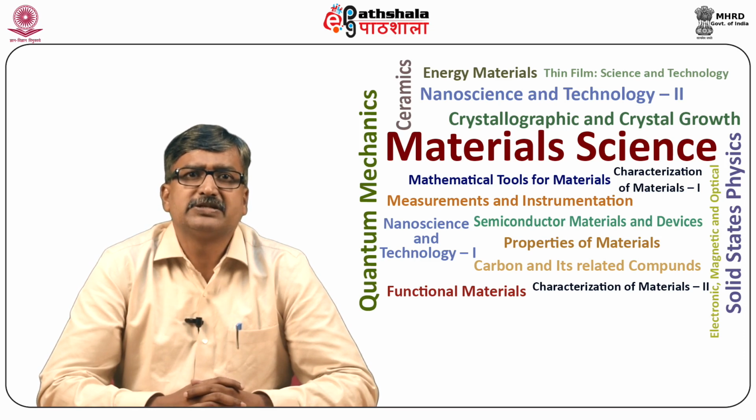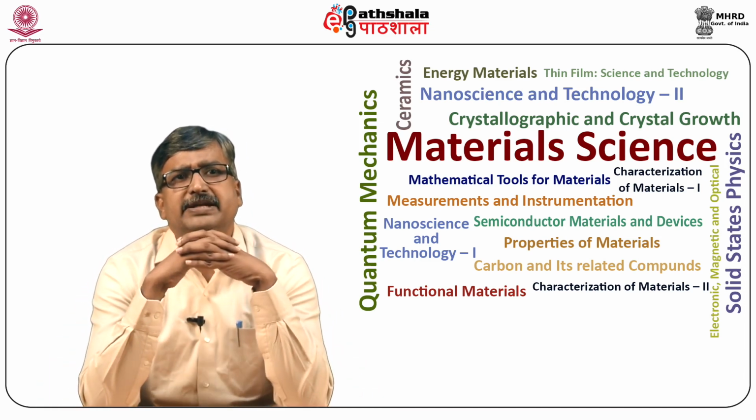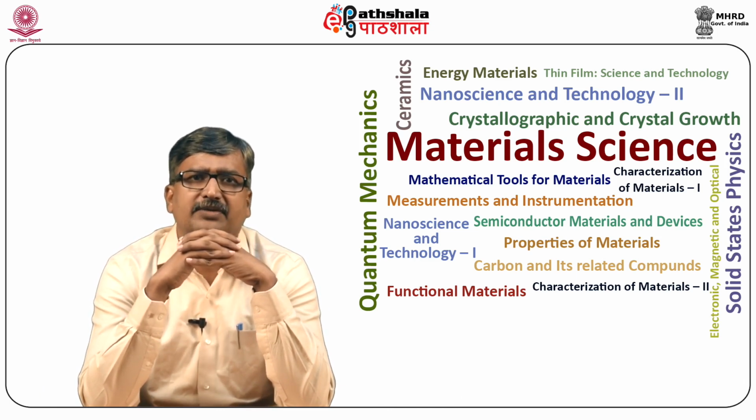Ultraviolet and visible spectrometers have been in general use for the last 35 years, and over this period have been the most important analytical instrument in the modern day laboratory.